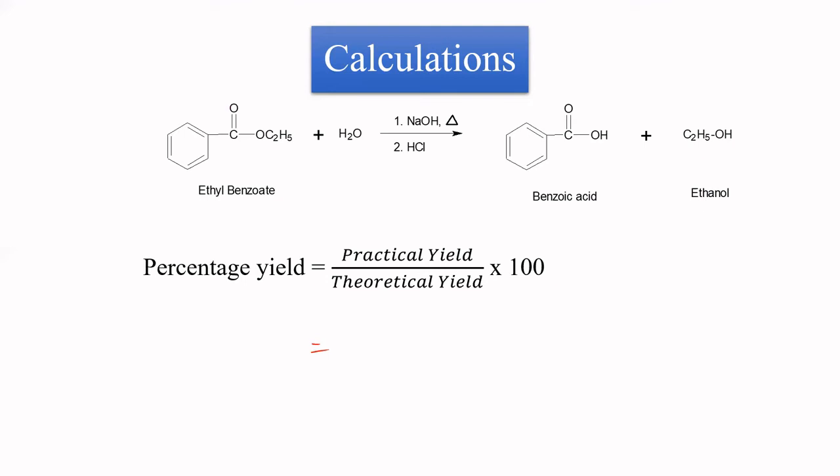So once the calculation is over, our next part is the purification. We have got the benzoic acid, right? So we need to do the purification of benzoic acid. Now for the purification, the process we use is crystallization. Now, in the crystallization, we are supposed to do the selection of a solvent. How should the solvent be? It should be inert, should not react with the benzoic acid, right?